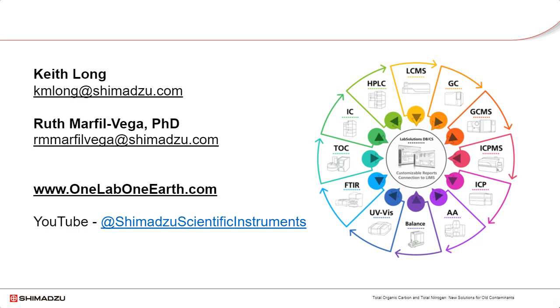So a lot of times you'll have to check, because the differences in the models or even maybe some accessories you have may change the applicable detection limits. So a good place to look, as Ruth mentioned, is we have an application handbook in the links. That is a collection of all different types of analysis using different accessories. And in there, it will show you the actual detection limits, limit of quantitation for different methods for these different configurations that you might have.